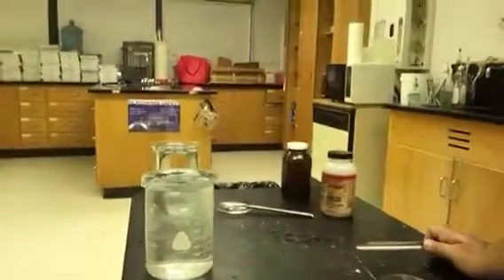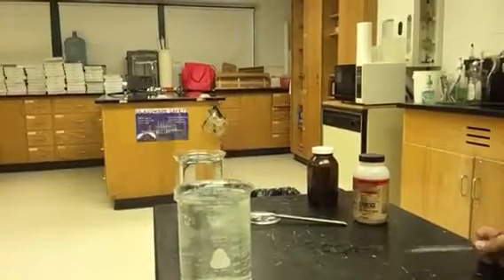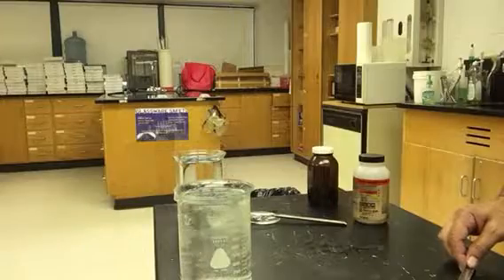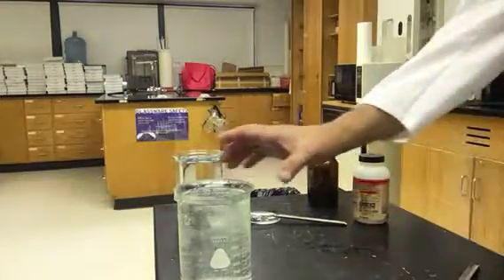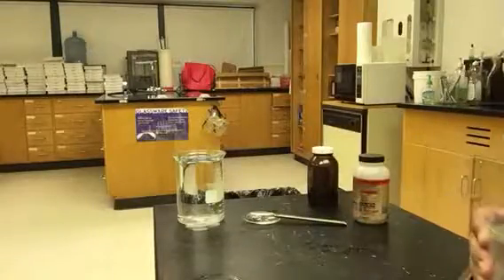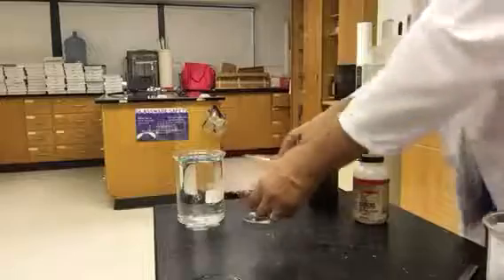Now, if I had a big enough piece of that sodium, I could have actually observed it start sparking and maybe even catch on fire. If it does that, it's a very yellow color. I'm going to set that aside. Let's take a look now at potassium.